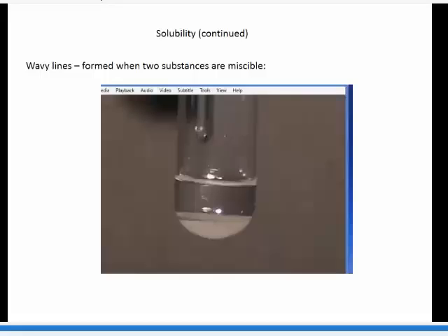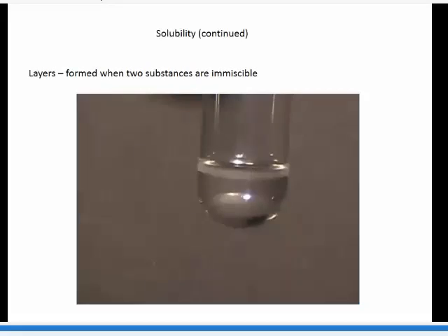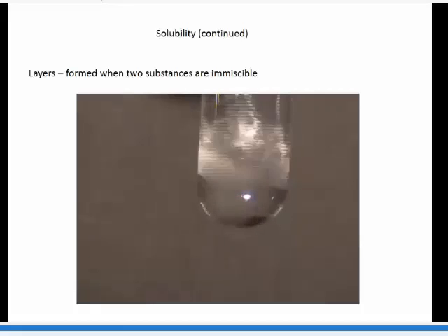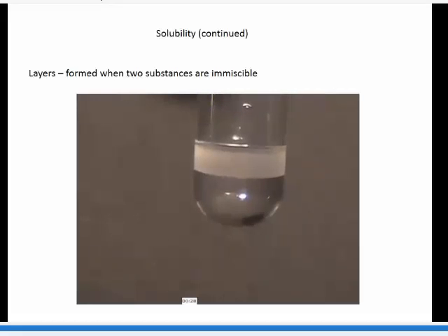In the other case, we'll look at cyclohexane and water. What you see here is on the top layer is cyclohexane. Cyclohexane is less dense than water, so it floats on top. And you take these guys and stir them up very vigorously, really try to get them to mix together. What you find in the end is you're not going to get there. They're going to still stay as layered. That's an example of immiscible types of compounds.